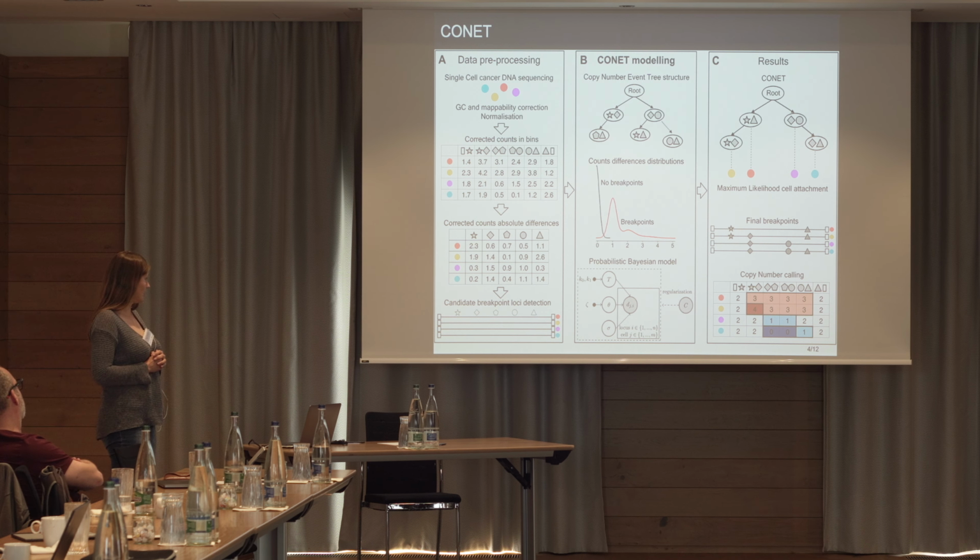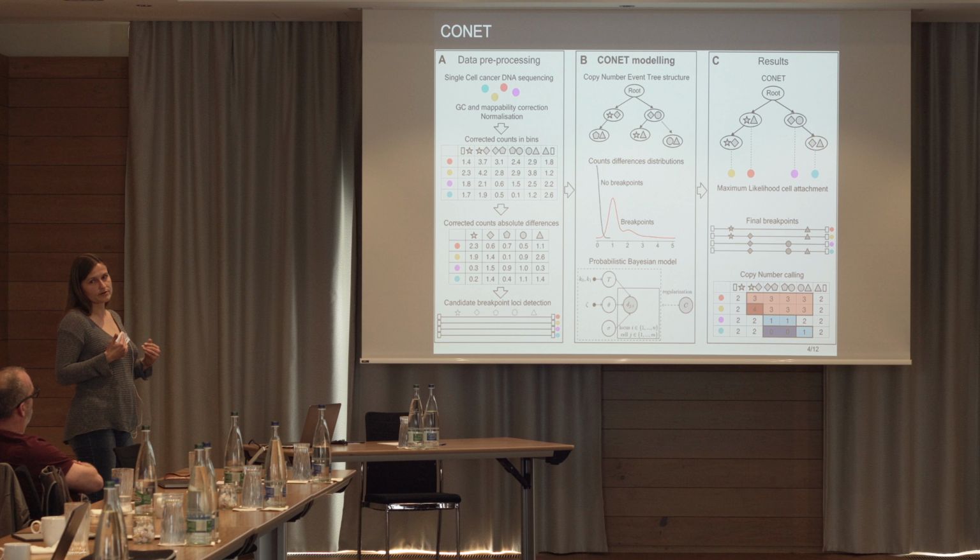The last step of the preprocessing of the data is establishing the set of potential breakpoints. So we just need to say which breakpoints we consider to be part of copy number events. And this is more or less the user's decision. The more breakpoints we include here, the longer the modeling step can be.